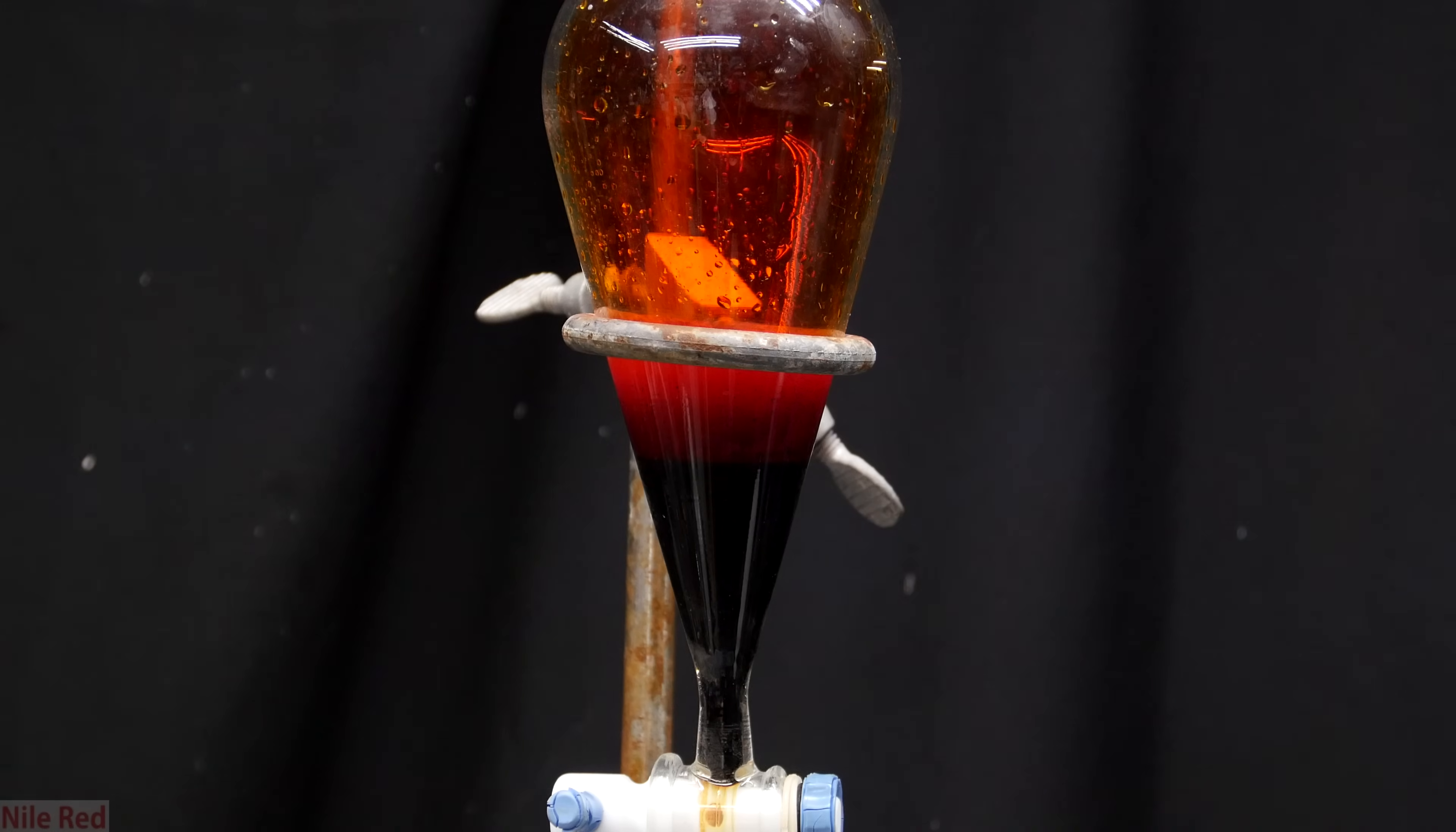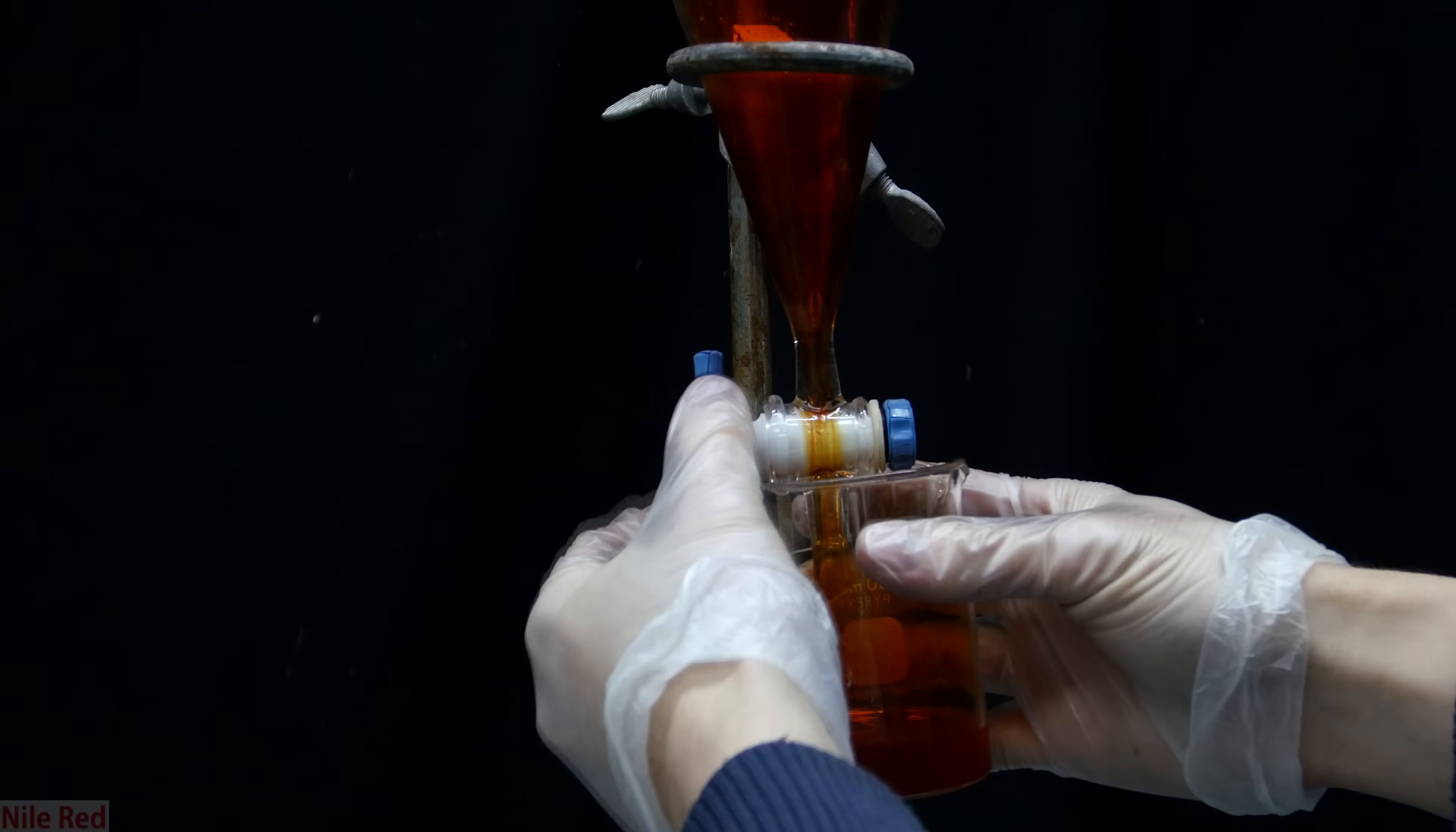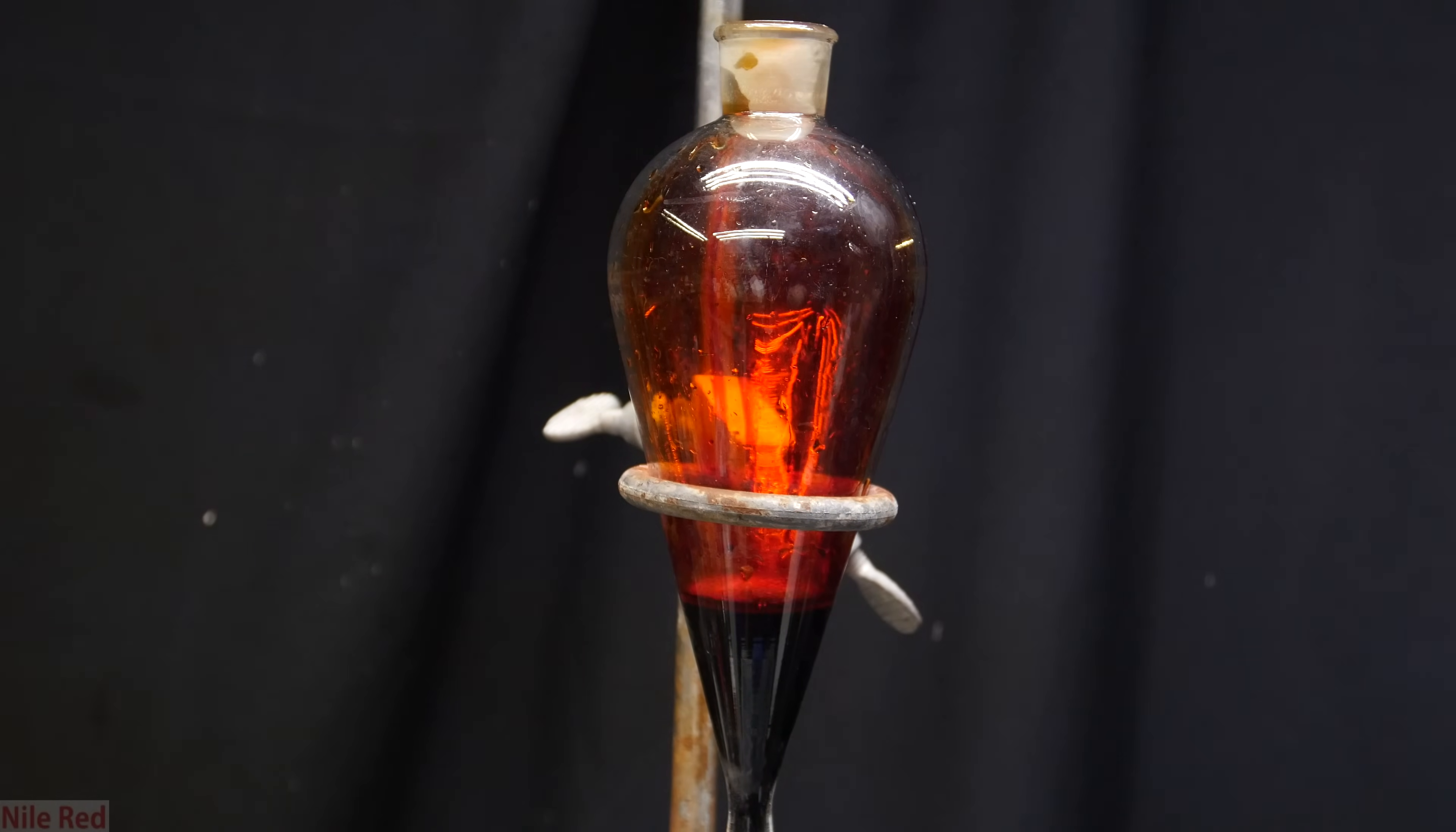Once it's all in the separatory funnel, if you look at the top, you can actually see a water layer. So to get rid of this, I used a beaker and I drained our bottom layer bromine into it. The top water layer is pretty contaminated with bromine so it needs to be drained off and neutralized using sodium thiosulfate. The now cleaner bromine is then poured back into the separatory funnel. You can see just how much fuming is occurring so it's really important to do this in a well ventilated area.